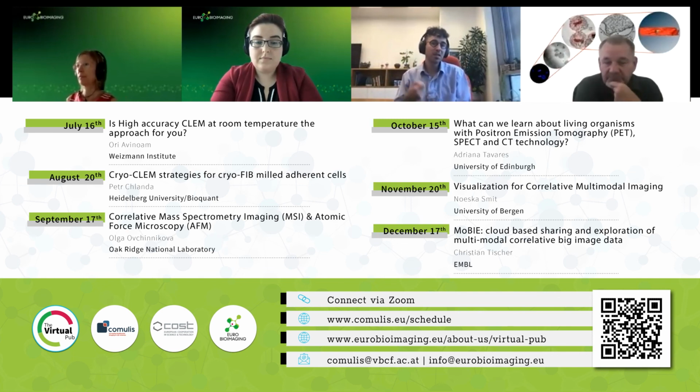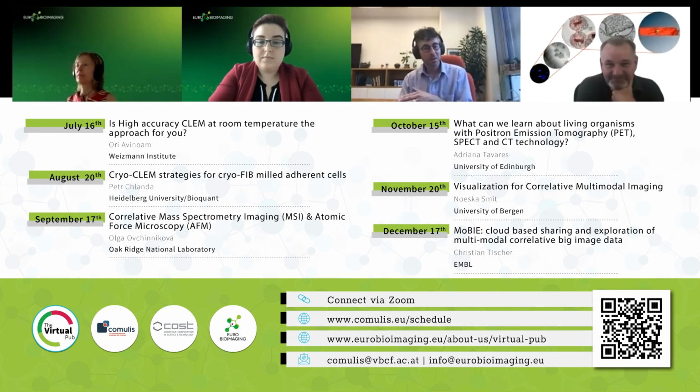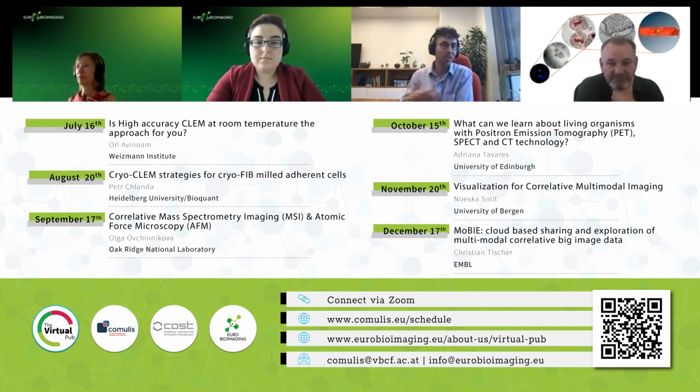So yes, these are kinds of flexibilities that one has to think about to get to the throughput that you need. It also depends a lot on the computers you have, and we don't always have the flexibility of interfacing with the microscope as much as we want. So definitely doing some things offline to speed up the online is a good idea. Thank you.